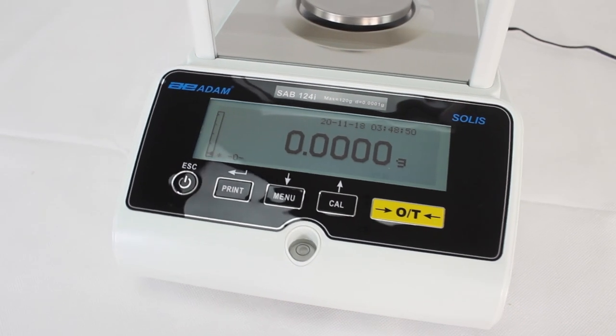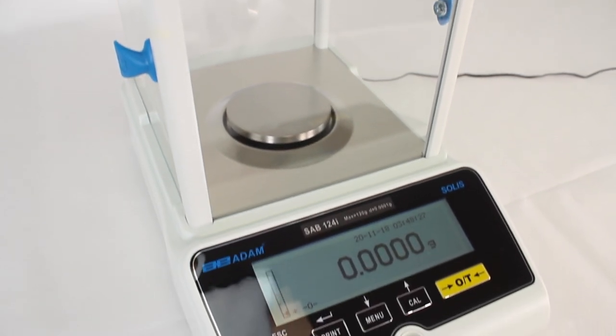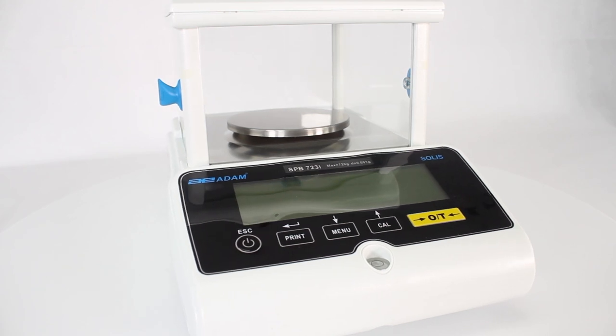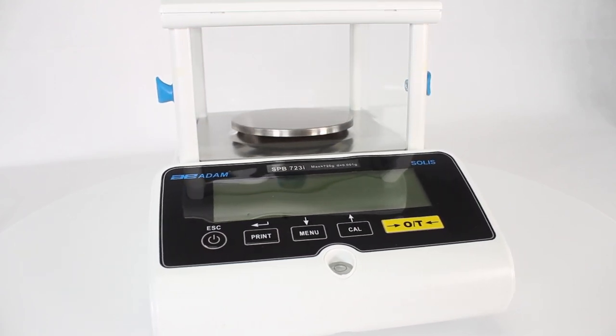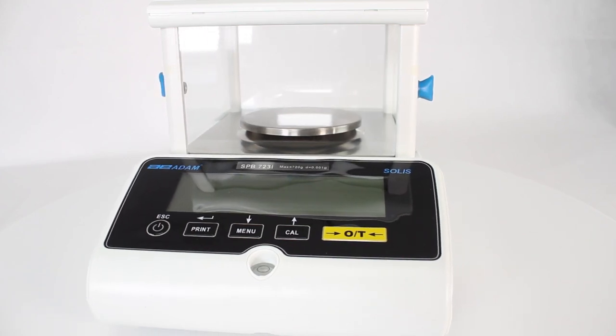Dual-range semi-micro models boast capacities of 120 grams and 220 grams, with readabilities of .01 milligram in the fine range. Salus offers the unique combination of high capacity and analytical readability.